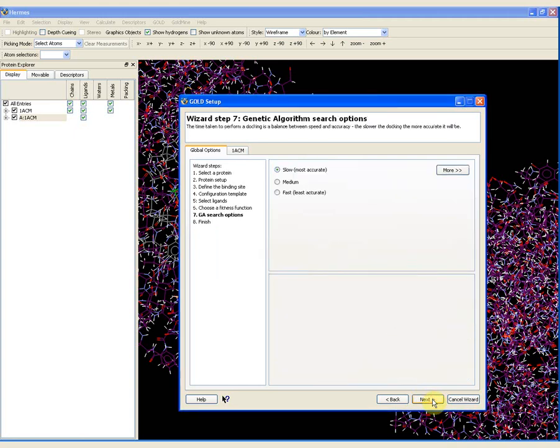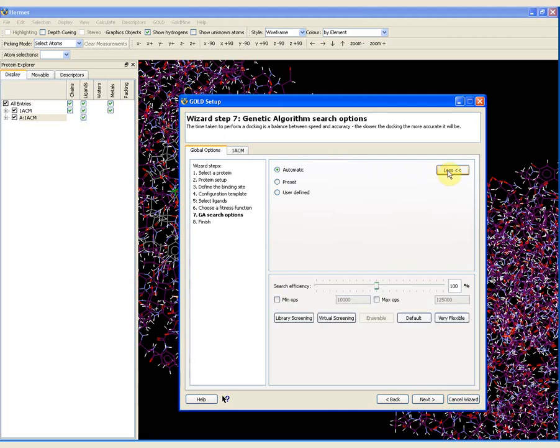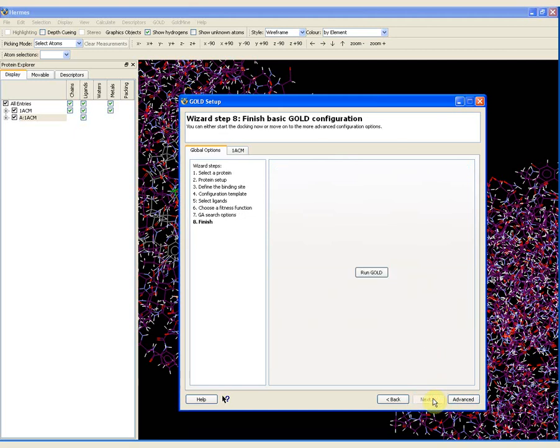I can now click next to go to the genetic algorithm search options. Again, the default is chosen — being the slow or most accurate — and this is perfectly appropriate here. If I click more, I have access to other options such as changing the search efficiency.